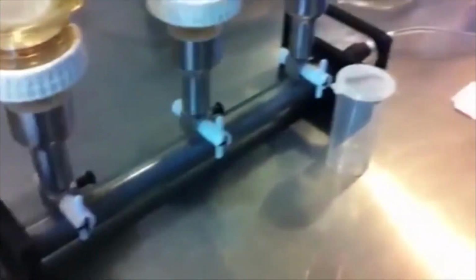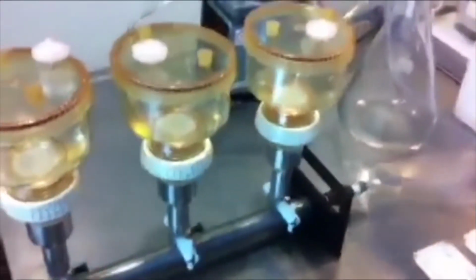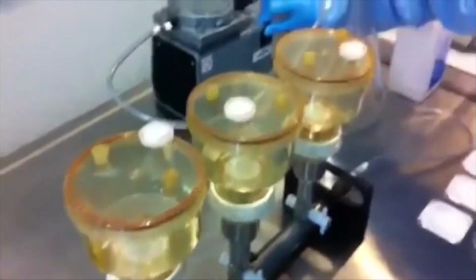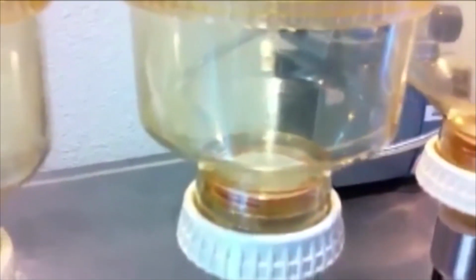Now, the next step is to check to make sure the valves down here are in the right position. And they look good? Okay, and then we're going to turn on the pump. And how long does this take? It doesn't take that long. Within seconds. Okay, so you can see it's being pulled through here, through the manifold, and into the receptacle. Okay? And they are just about done.